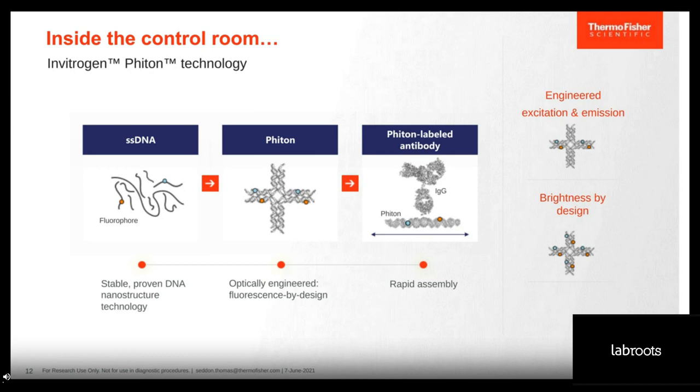And you can see here, for instance, the top one is showing you a 2-cluster version, and the bottom version is this 4-cluster version. And so what that means is that you can continue to build out in terms of brightness.